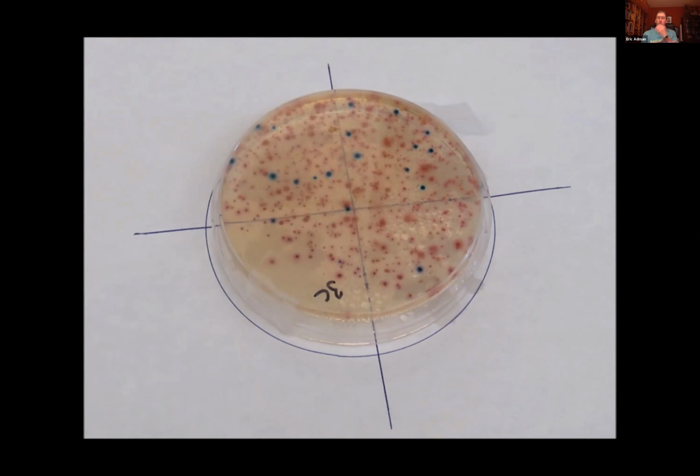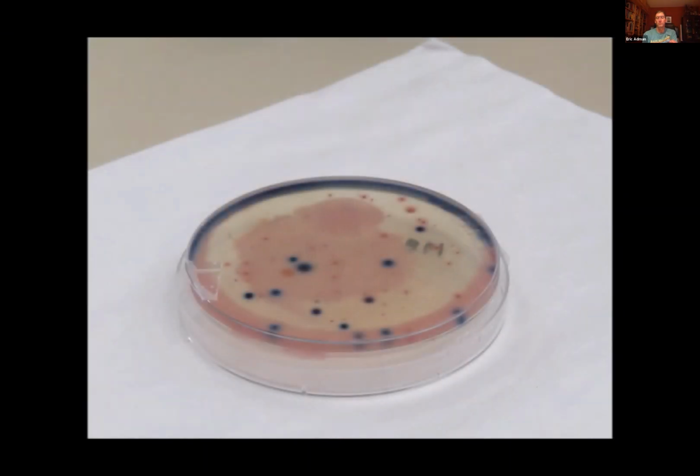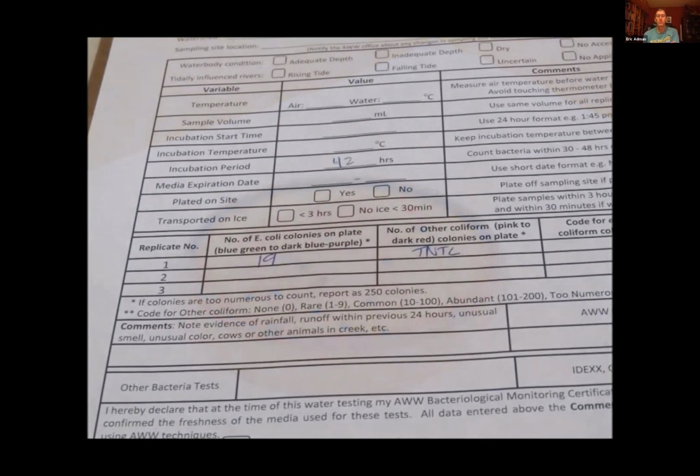Estimates of more than 100 colonies should be reported as abundant, and estimates of more than 200 colonies should be reported as too numerous to count. This sample should be recorded as too numerous to count. If colonies appear as a ring around the edge of the plate or as one large blob, count as one colony. Record both the number of E. coli and other coliforms on the data form.